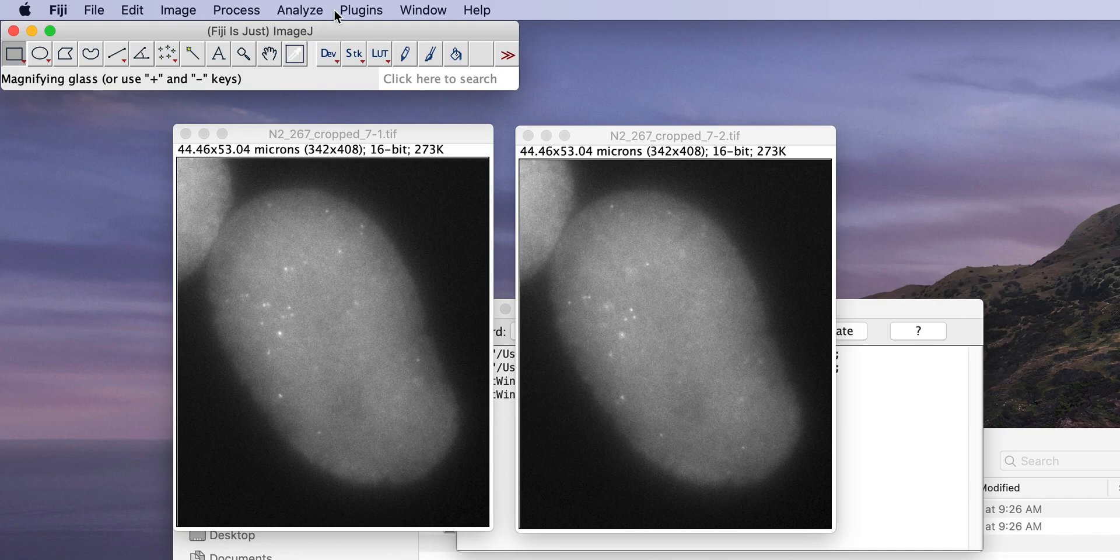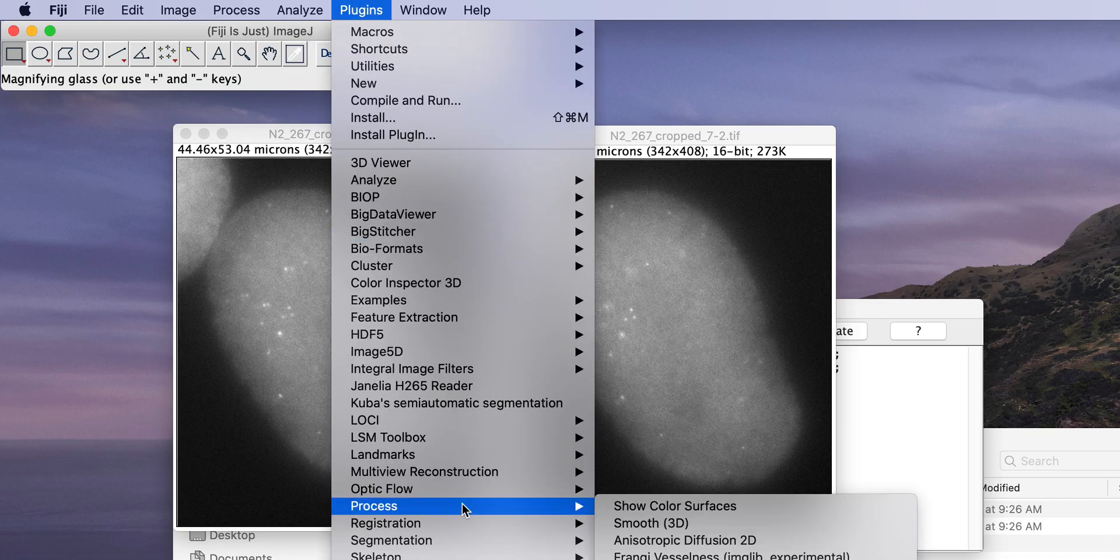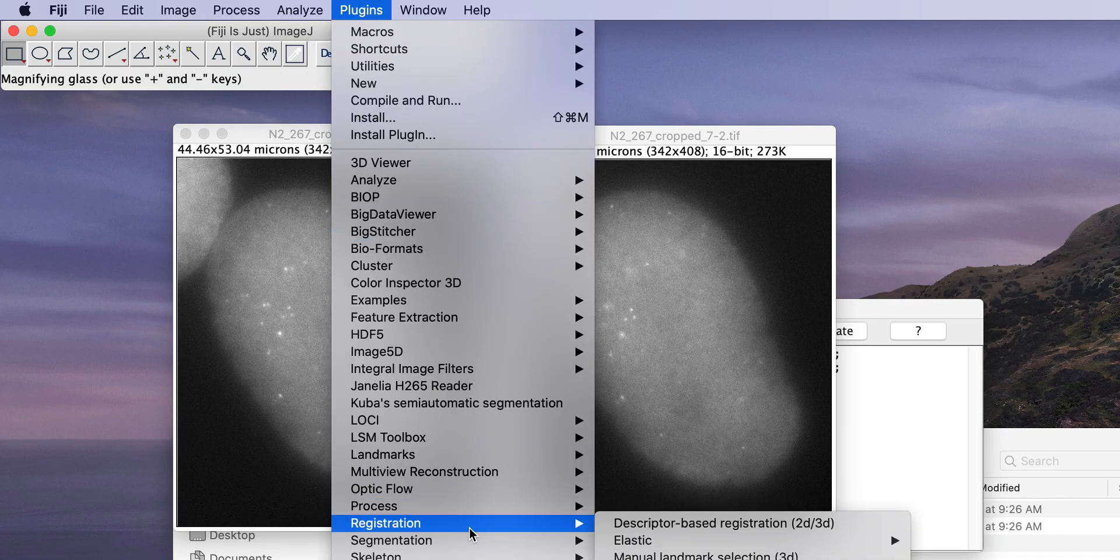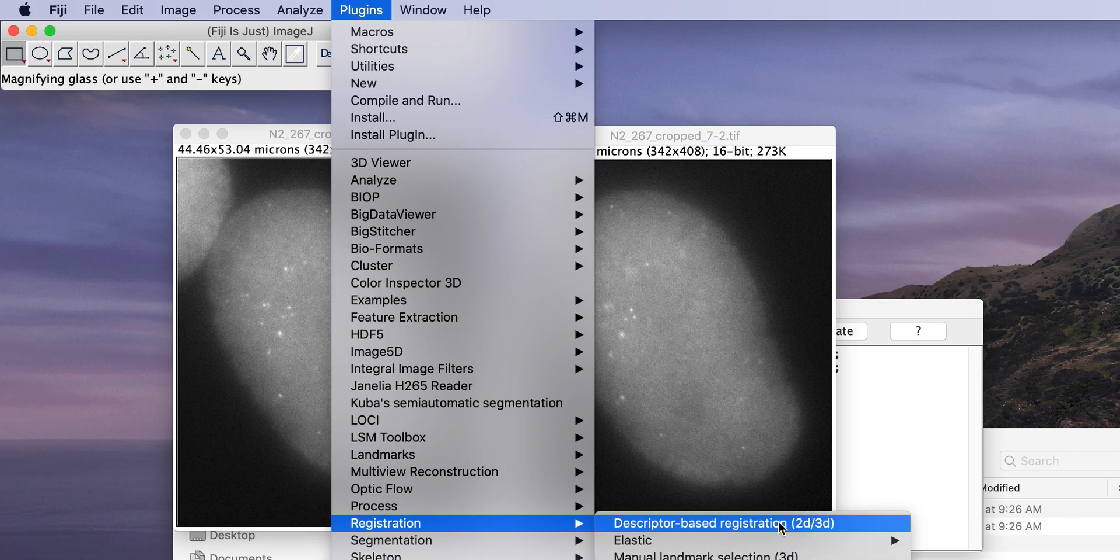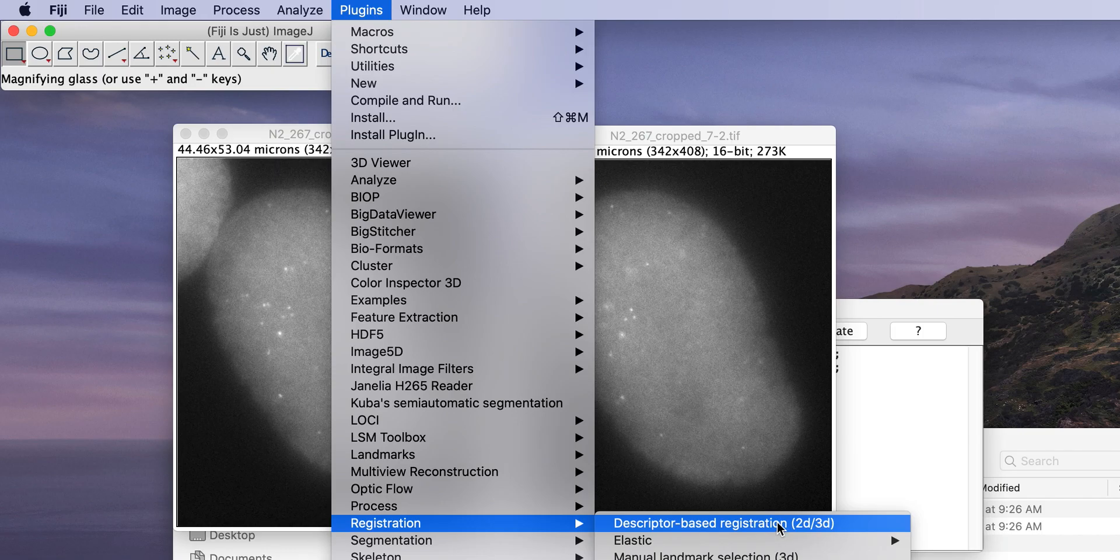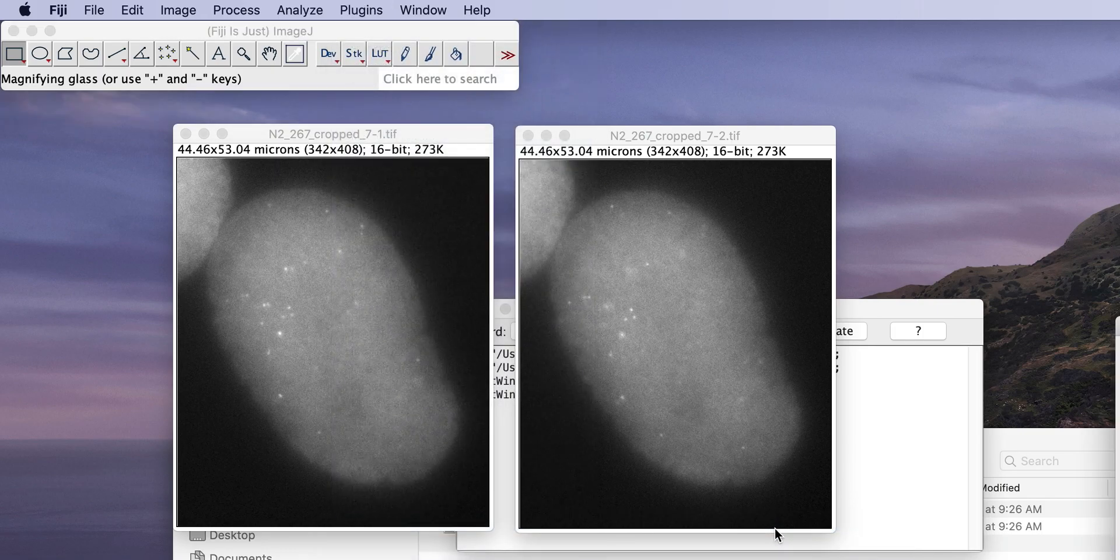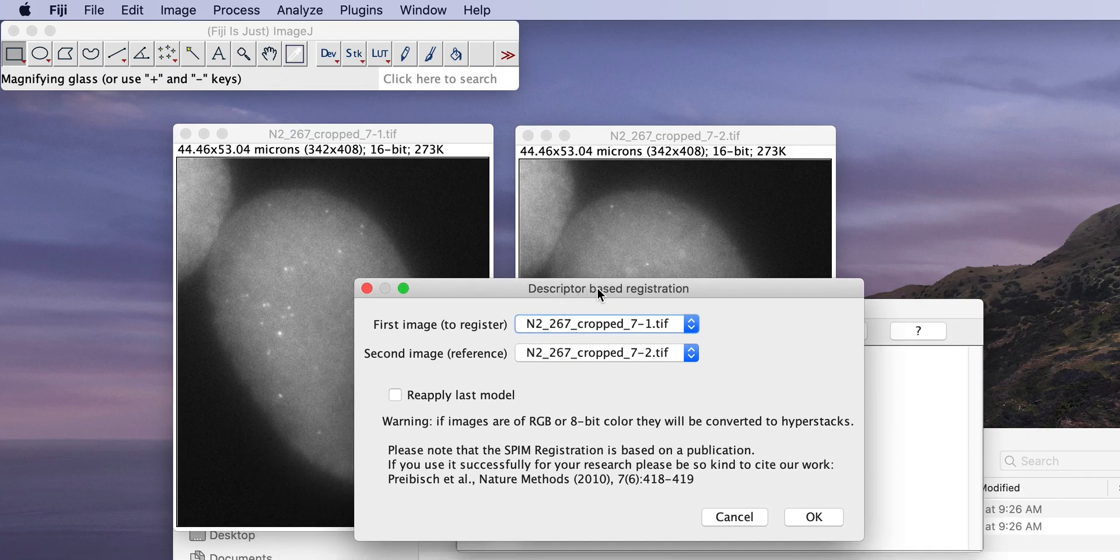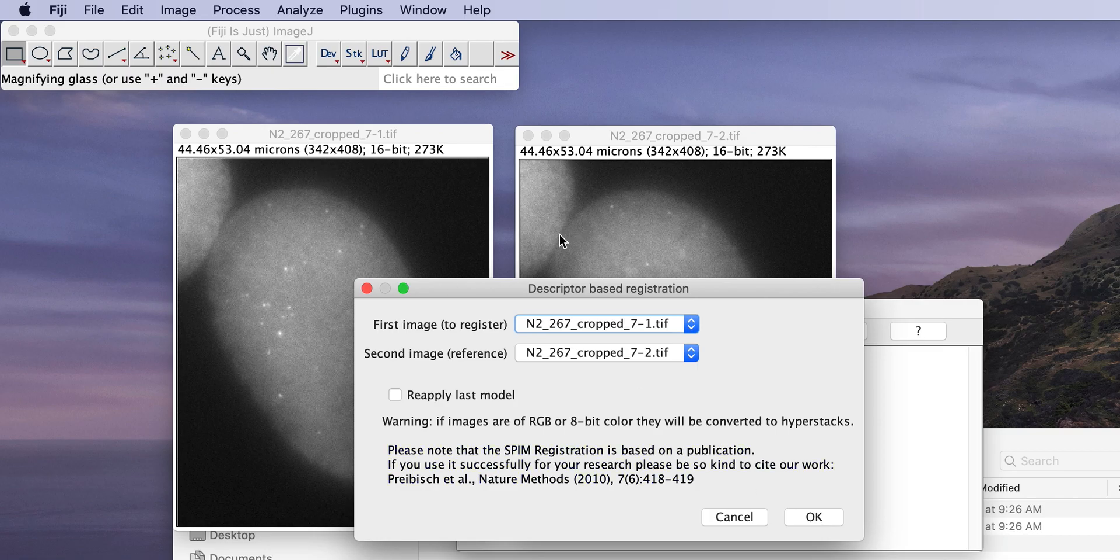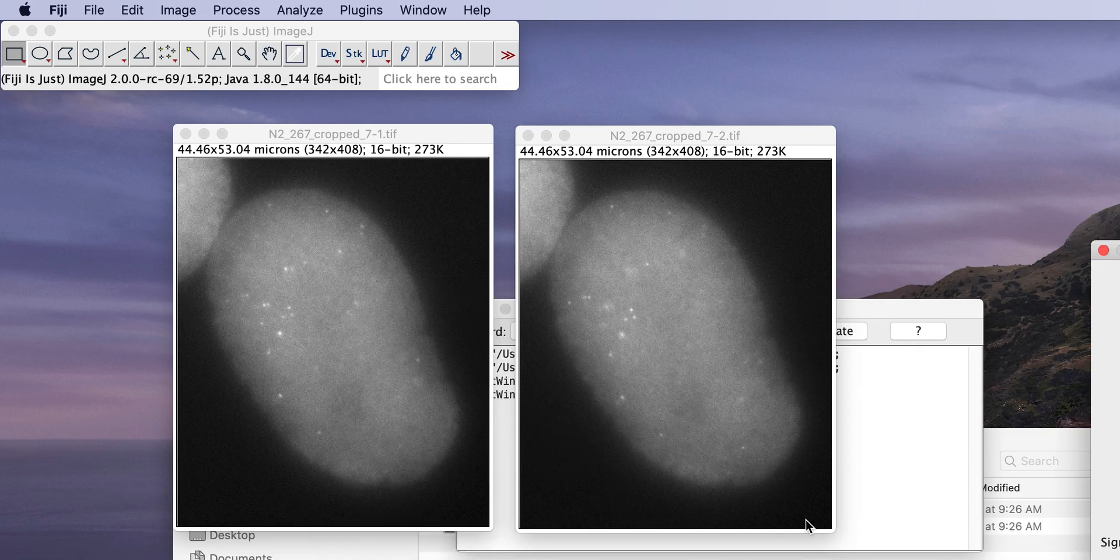So now we go to plugins, registration, descriptor-based registration. There's also the descriptor-based series registration down here that you would choose if one image is actually consistent of a time series that you want to stabilize. But for now we just registered those two images and it's basically the same parameters. Okay, it asks you which two images to register, one and two. Okay, this is the two that we're interested in.